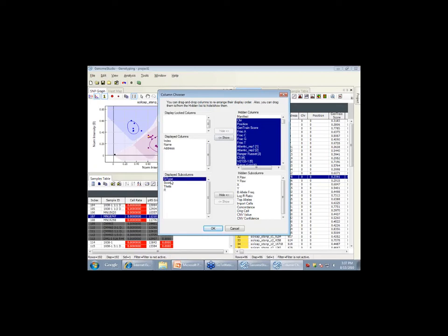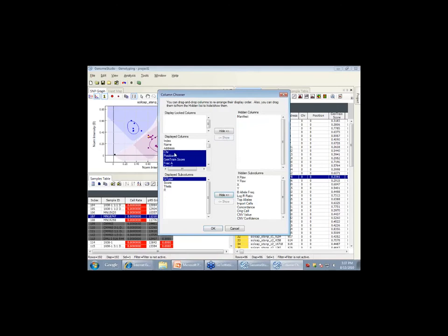Sorry, I made a mistake. I'll undo that. I'm going to take away chromosome up to where the samples start, Atlantic Rep 1. Chromosomes up to fraction T, and I'm going to hide that. And I'm going to keep the samples, which is the rest. I'm only going to capture the theta score, the data point. So I want to highlight genotype, score, and I'm hitting the control key and R, and I'm going to hide those. Does everybody have that?